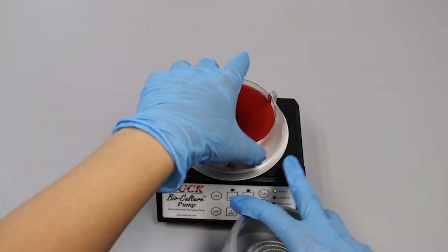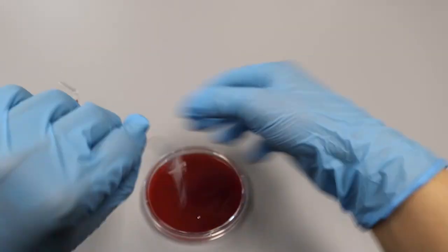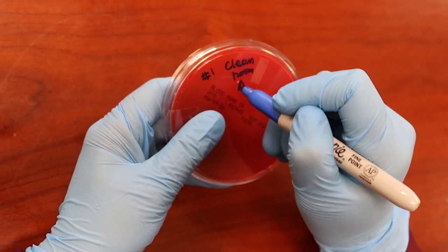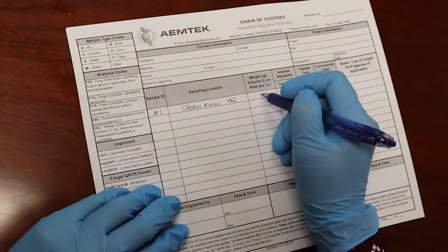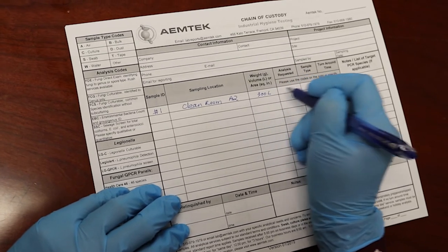Unscrew the head and remove the agar plate. Close the plate and seal it with scotch tape. Label the bottom of the plate with a unique ID, location, and date. Then record the flow rate, time, and amount of air sampled on the chain of custody form.